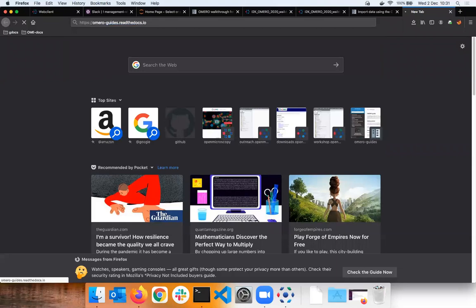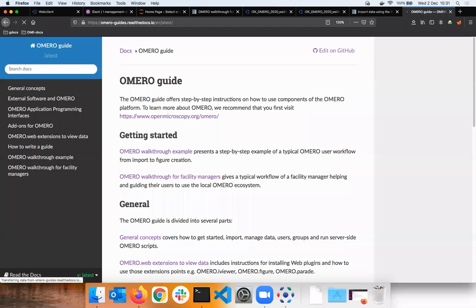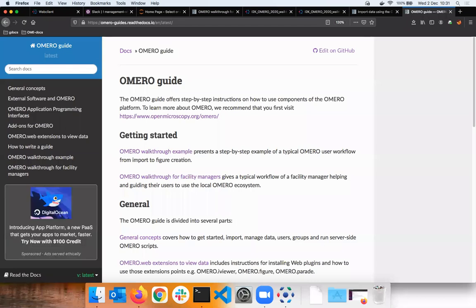You mean another Dropbox. Dropbox is a name, but we mean OMERO.Dropbox. It's not the Dropbox you might be talking about. It's a mechanism that will watch some directory that we have registered, and as soon as something comes in, then the import starts.